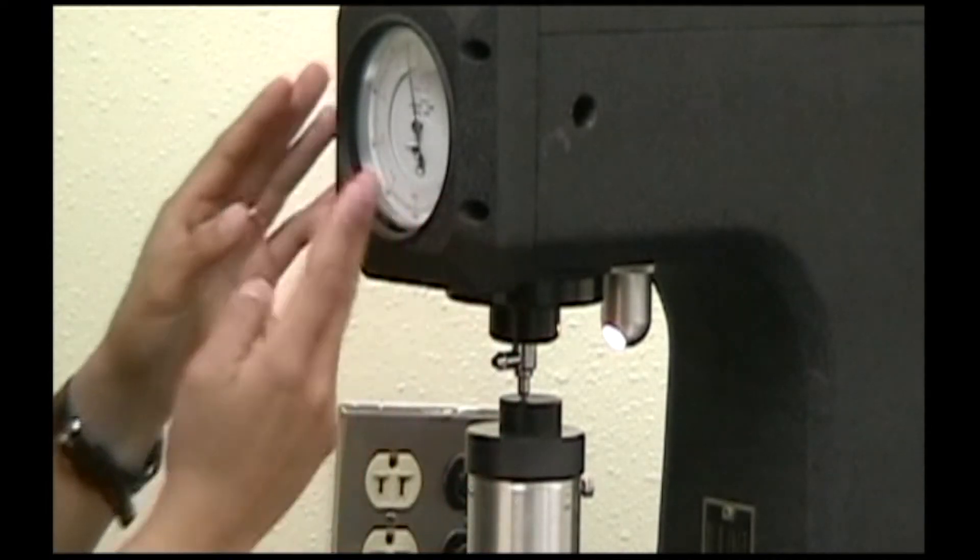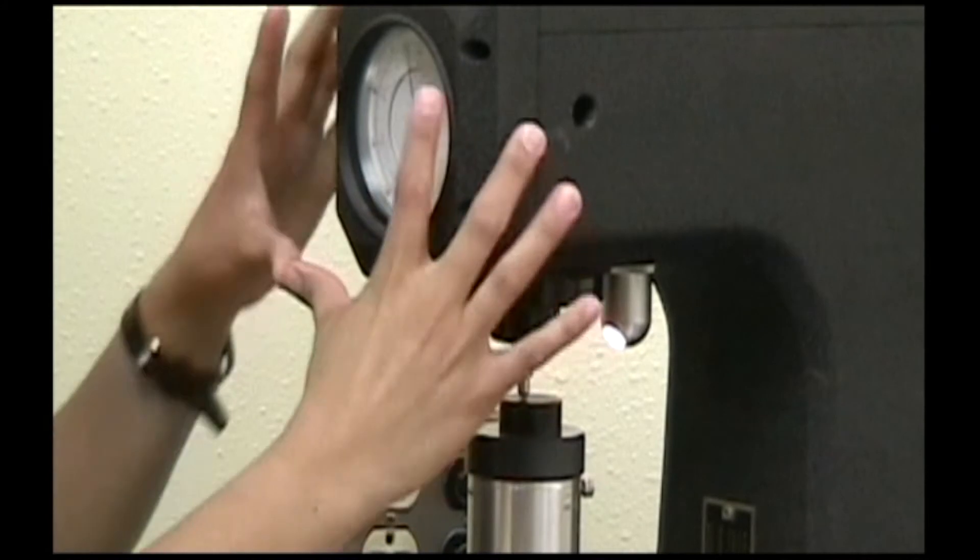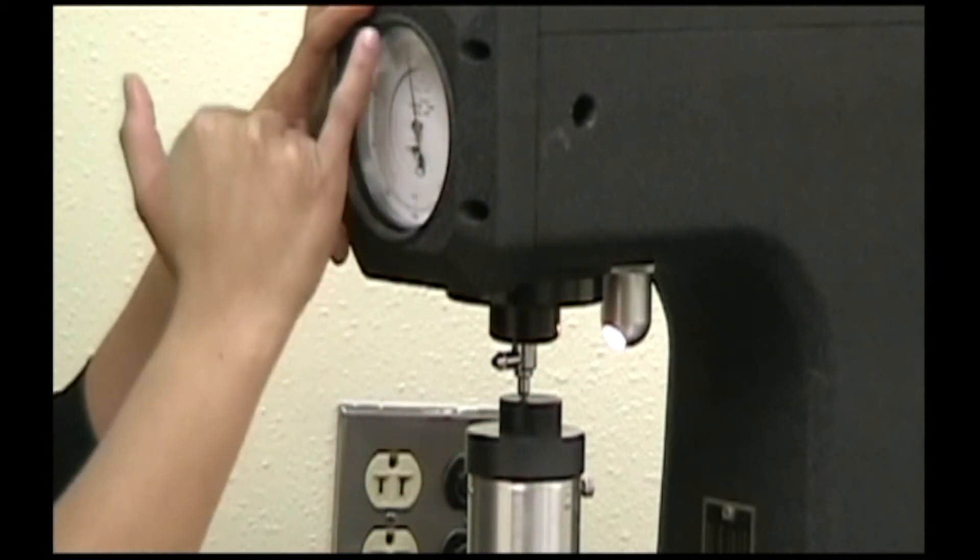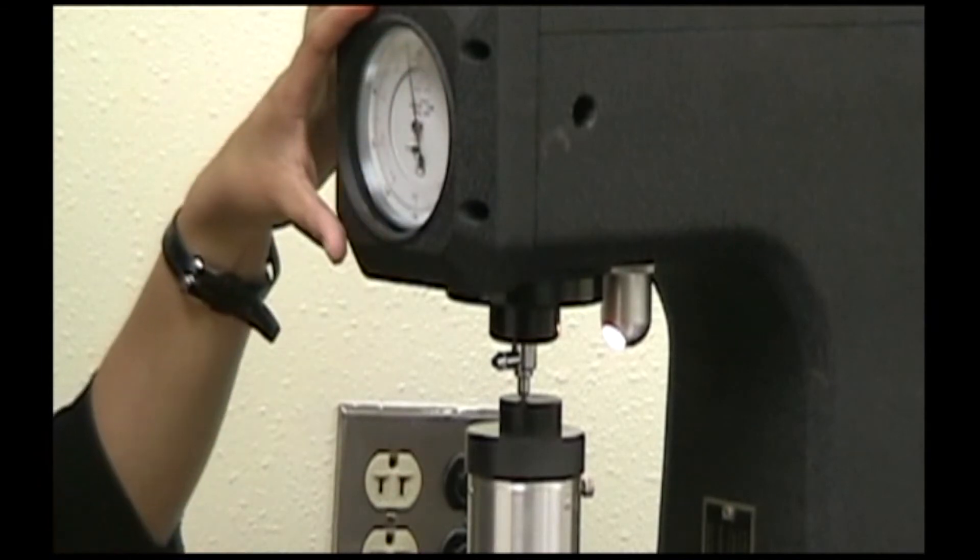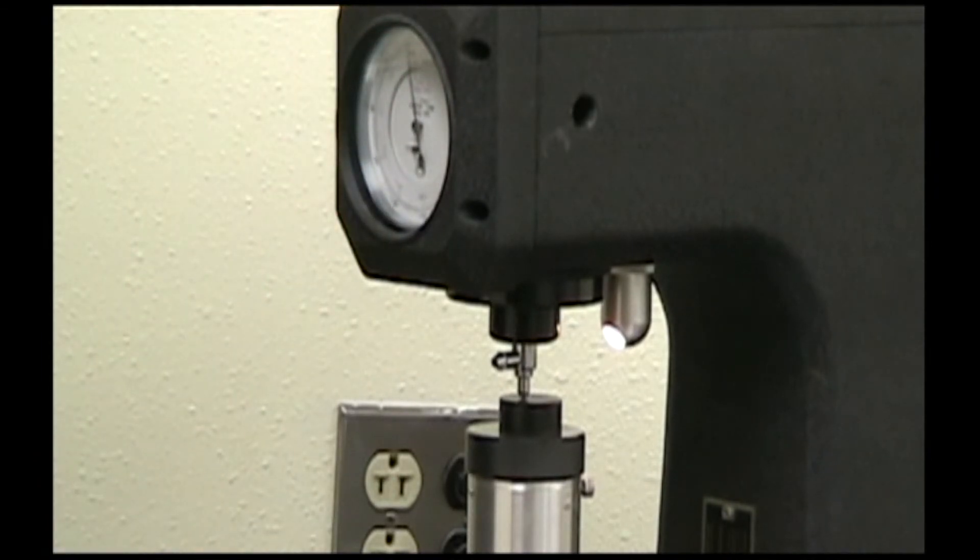And then you reposition the dial so that the needle is pointing at set or RB30 and RC0. And you do that by adjusting here.